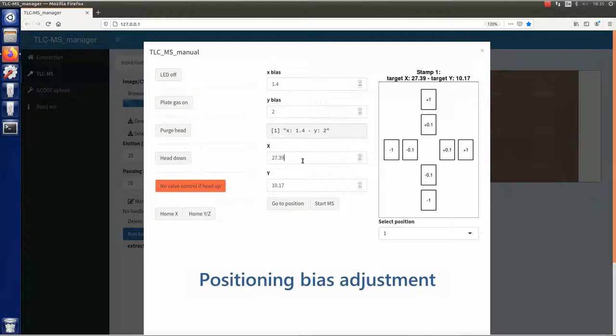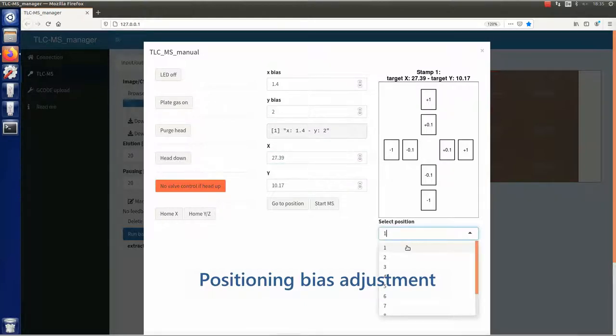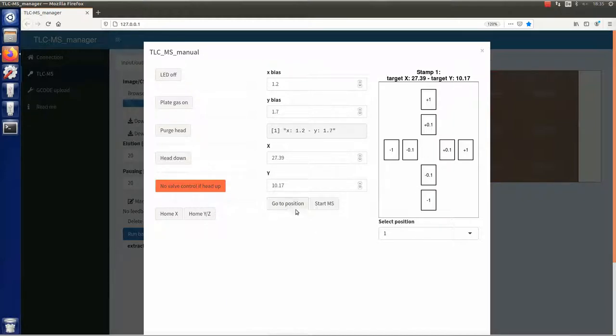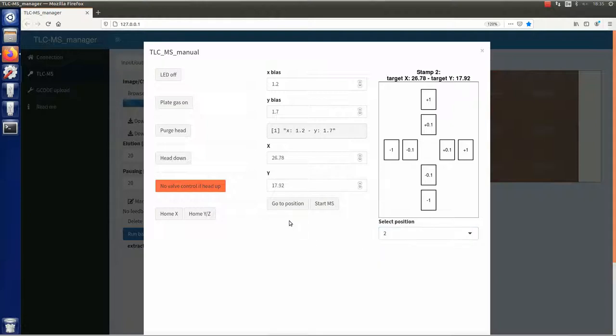If this is not the case, the assumed bias can be directly entered in the X and Y bias fields or, alternatively, can be adjusted by clicking on the plus or minus fields on the right. After adjustment, correct positioning can be checked by moving the plate holder to some of the selected elution zones.